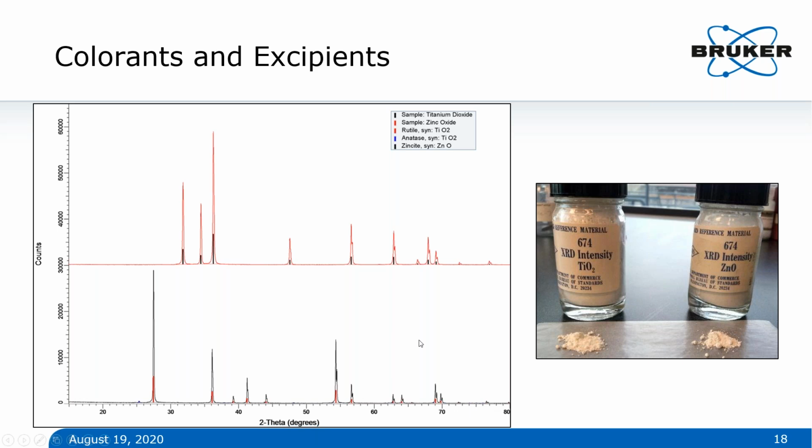These are standard NIST standards, so of course I would expect them to give you very, very good data. But if you're aiming for low noise, typically that would be the determining factor for good data.